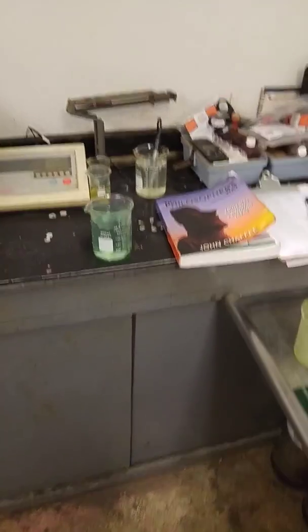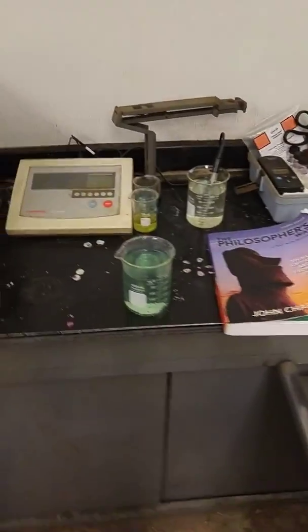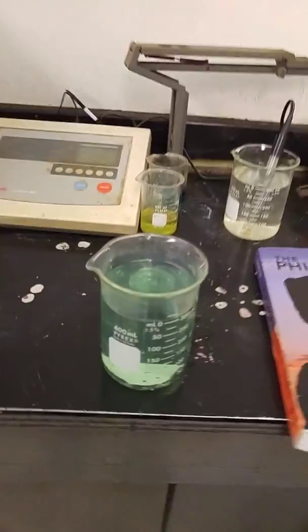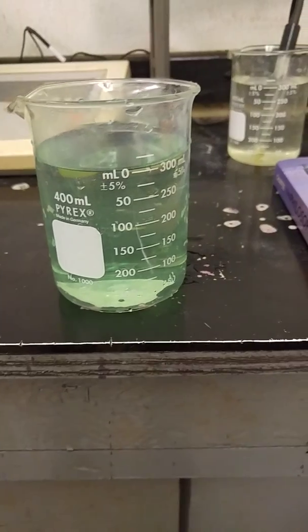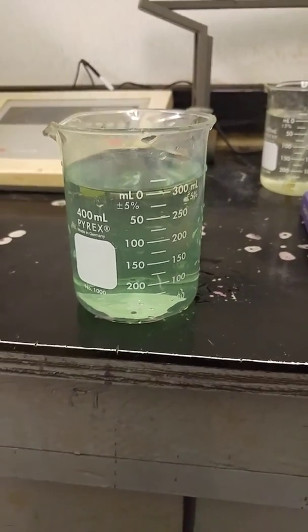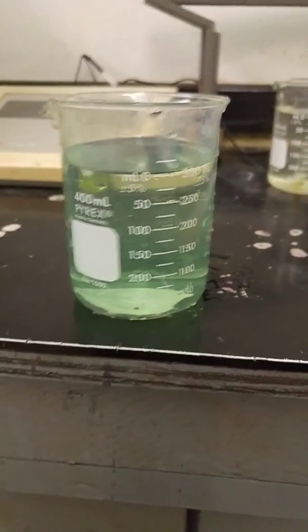I'm going to show you how it works and it's pretty neat. The first time that I saw it, I was pretty wowed by it. I have a glass of water here, about 300 milliliters, and this has a decent amount of nickel in it.